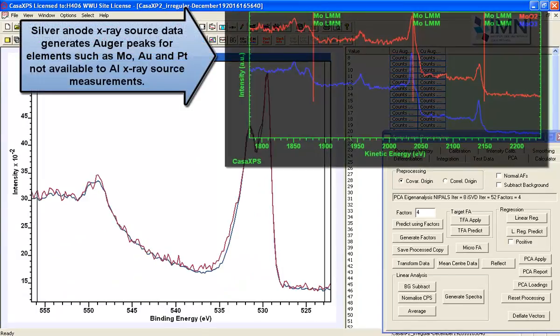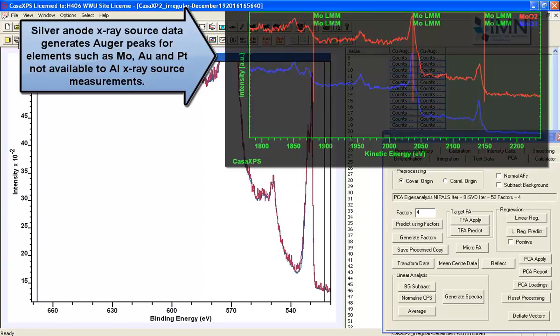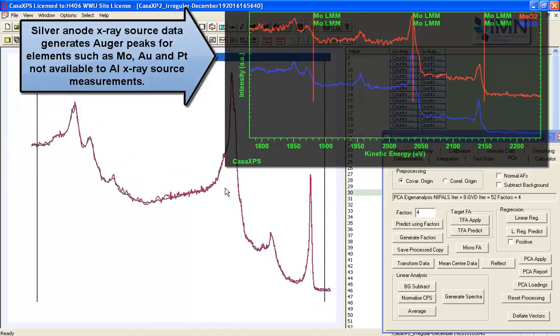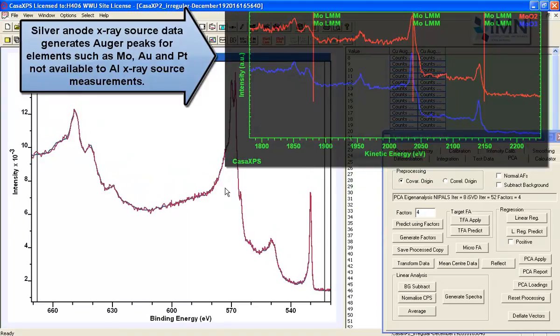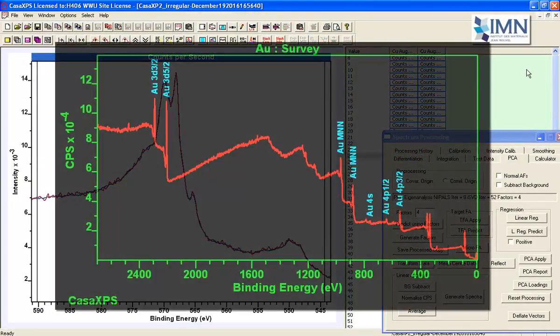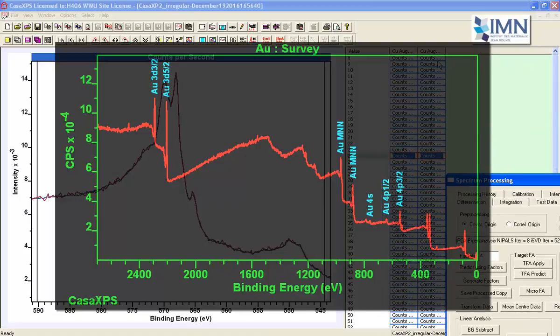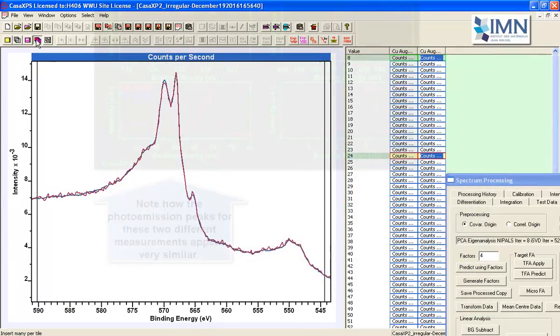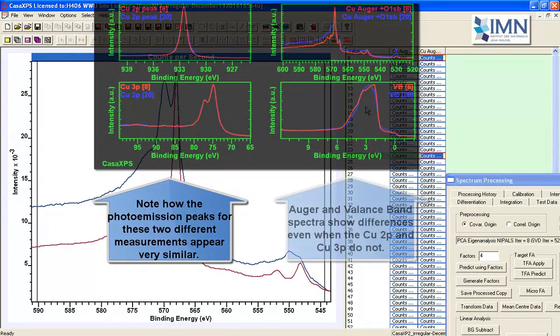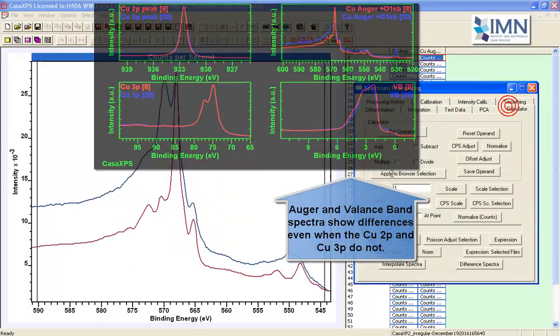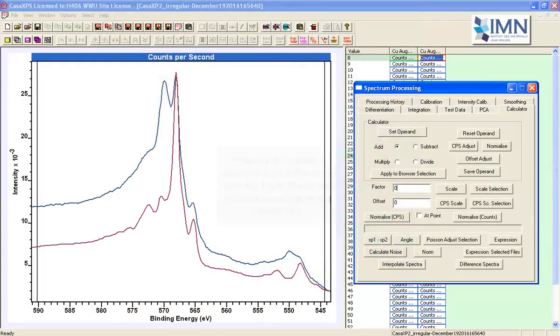We can then perform calculations and work out the different oxidation states for this copper, and this approach applies to other materials. Here's an example of molybdenum — we've got molybdenum Auger lines from a silver anode that can be analyzed in a similar fashion. Similarly, gold produces a sequence of Auger lines from a silver anode that allow us to work out differences between oxidation states that might not exhibit in the normal photoemission lines.